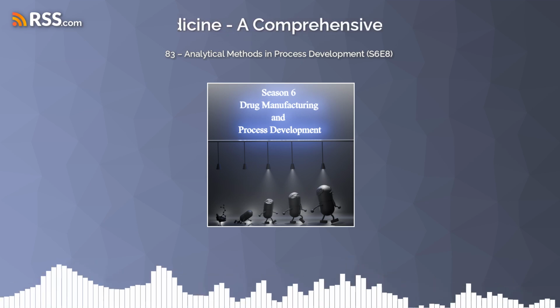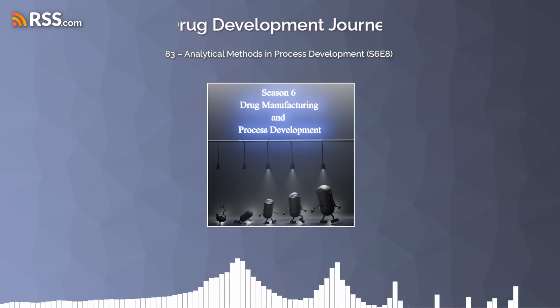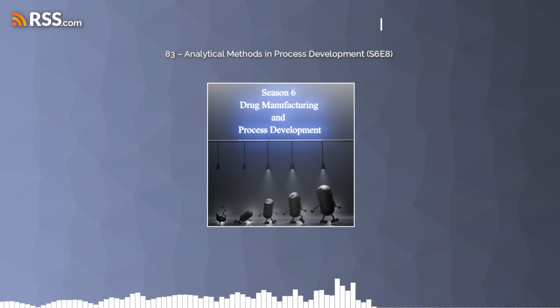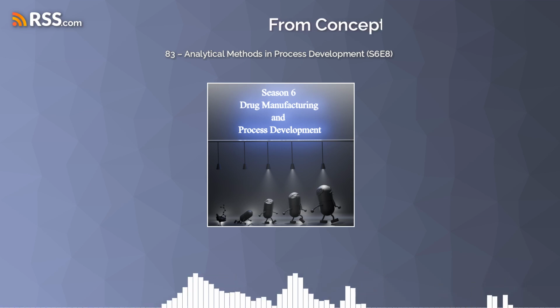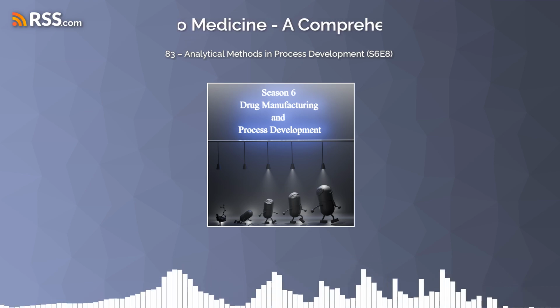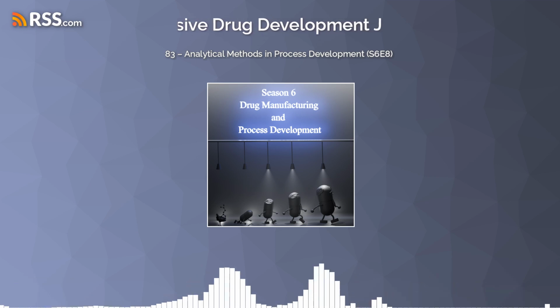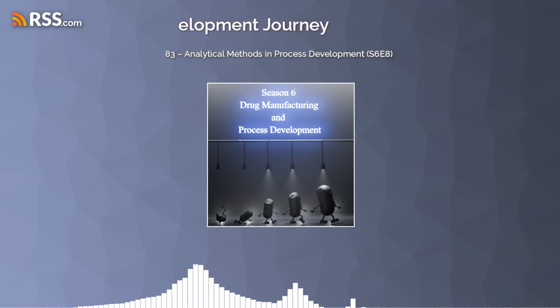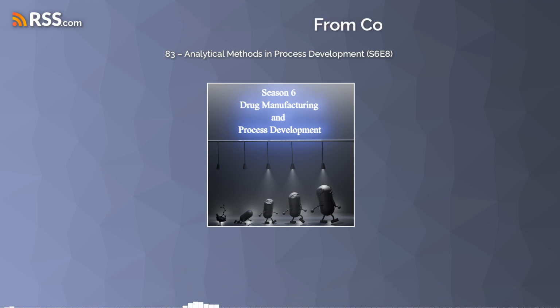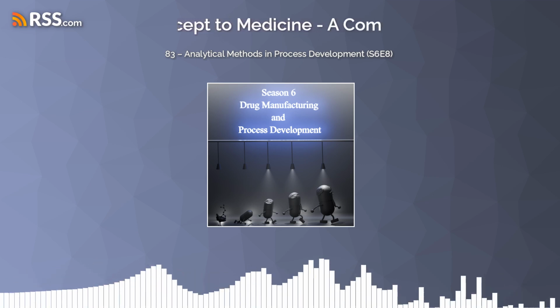It can also help identify unexpected byproducts, even if they're only present in small amounts. Even if they're tiny. Exactly, because NMR can reveal structural features that just shouldn't be there if you made the molecule that you intended. And one of our sources mentions how coupling NMR with liquid chromatography, LC-NMR, or even mass spectrometry, LC-MS-NMR, takes this even further, and it allows for really detailed structural analysis of individual components, even within a complex mixture. So you have a tool that not only tells you what's there, but how it's put together. Precisely. That's really cool. What about LCMS?